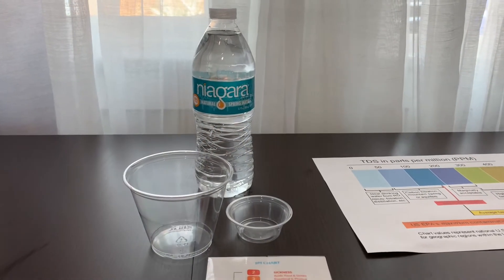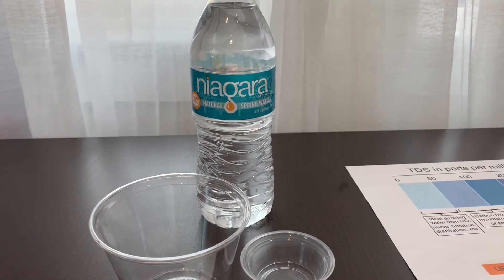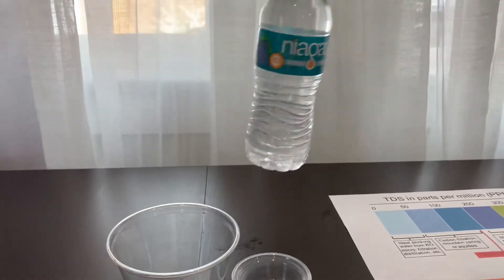This is Niagara spring water, sourced from protected springs and polymer melting. It comes with a BPA-free plastic bottle. Let's test the pH and TDS levels.